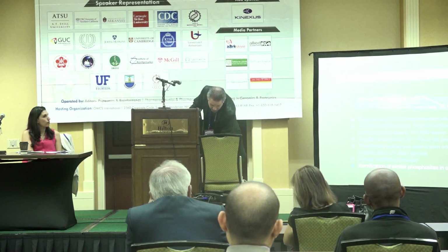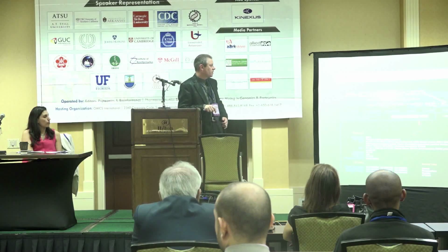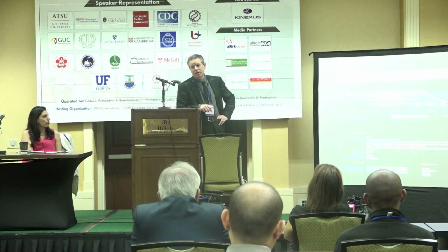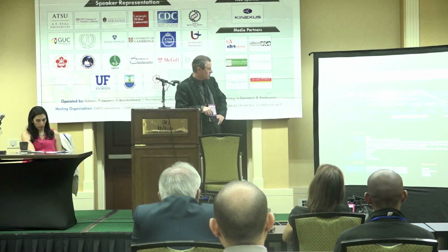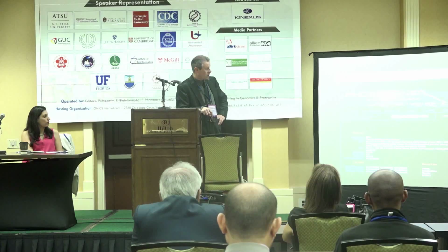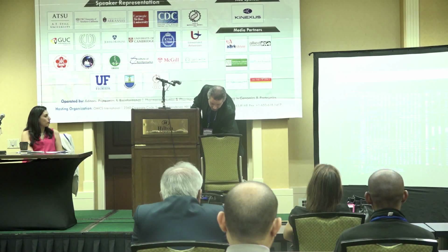So as you go to this site, you just enter the name of the kinase or its UniProt ID number or an alias, and it'll pull up the information on its identity and GO terms, and has direct links to other websites, our own in the SignaLink Knowledge Bank, but also some other important sites like UniProt and PhosphoSitePlus and STRING, where it'll go directly, in most cases, to the page.